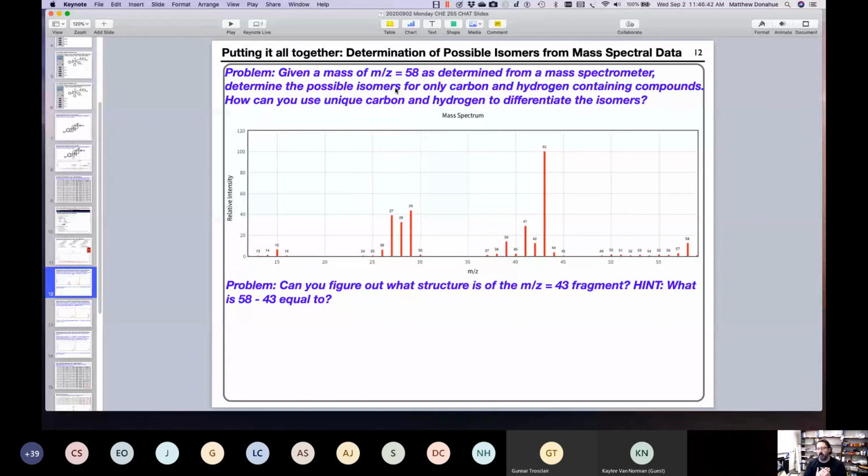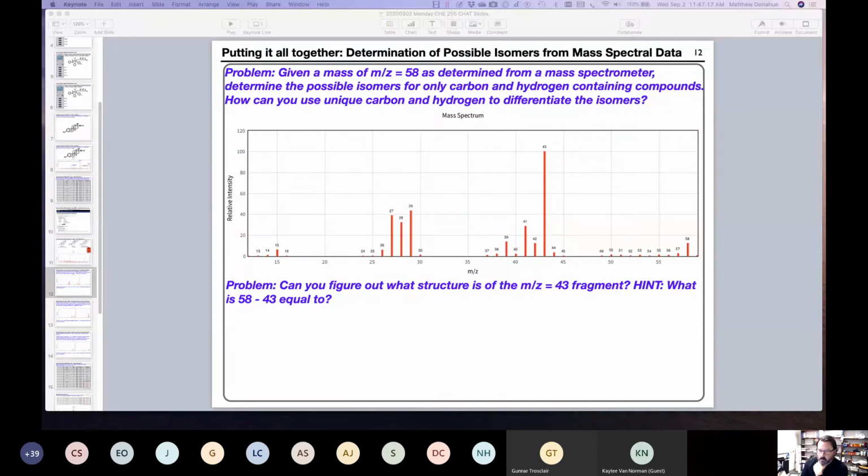From the molecular formula, determine the degrees of unsaturation, and then start connecting carbons to carbons, carbons to hydrogens, and proposing structures. The second prompt is what you use to differentiate those structures. Let me walk you through. Let me propose a question before I write something down on the cam, which I'm going to switch to now.